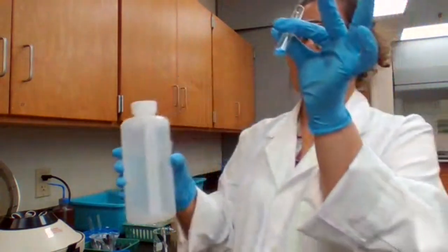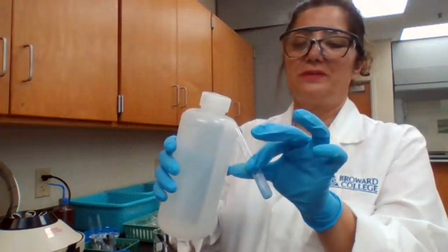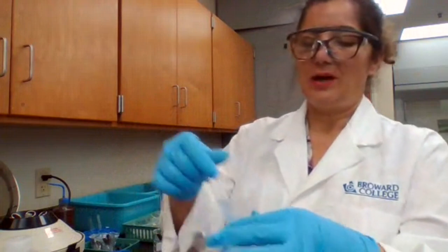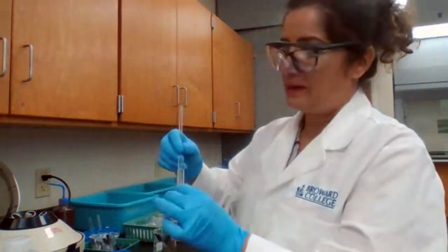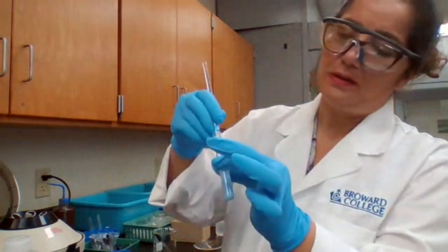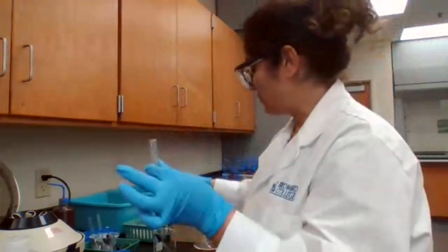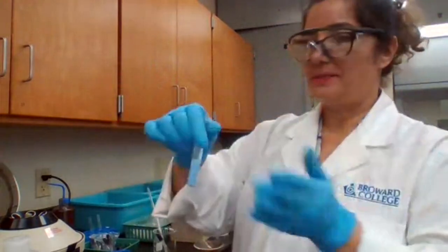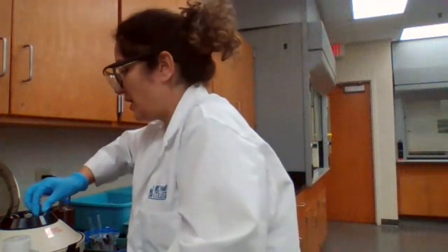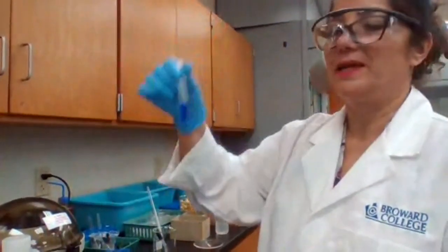Next step, I need to wash the precipitate. So I'm adding some water to wash the precipitate because we don't want any copper to be present. We mix it well, and we separate the liquid. Washing means you mix with water, you centrifuge and separate. Just discard the washing solution. But this solution you're keeping for the next step.